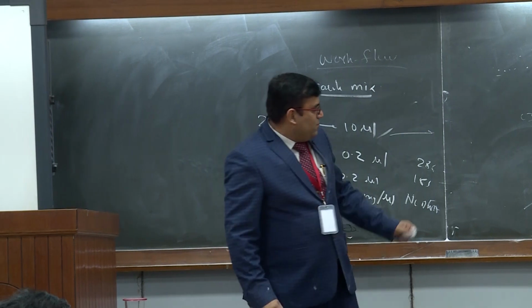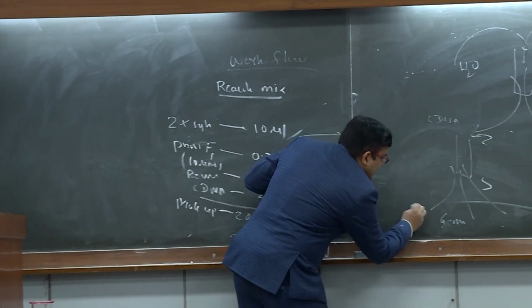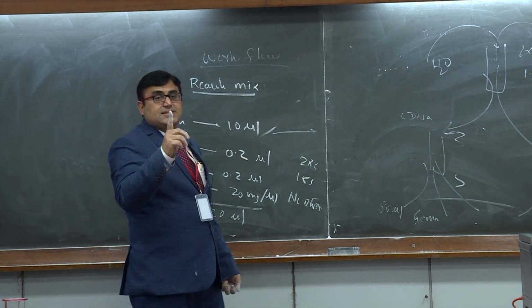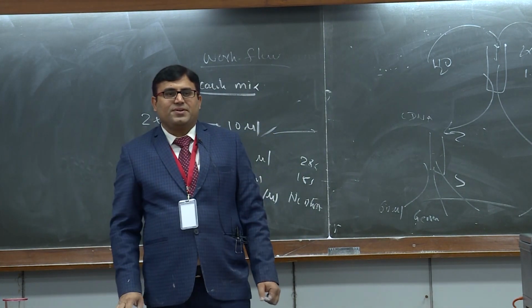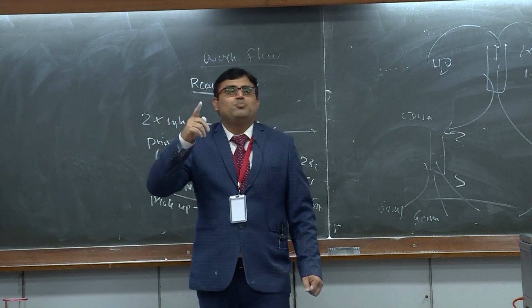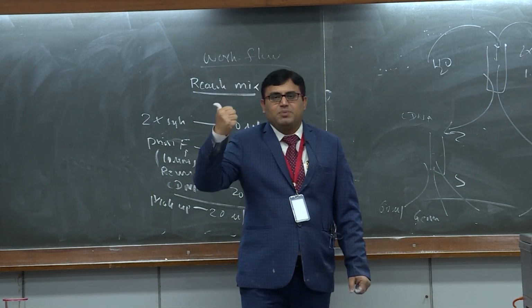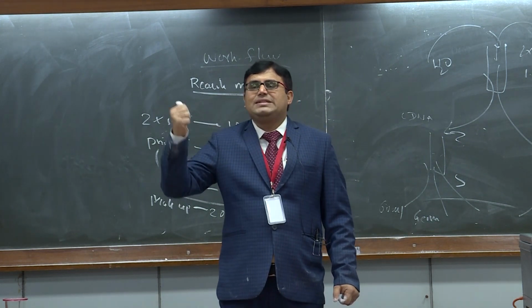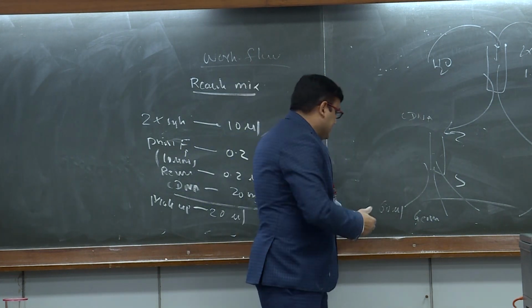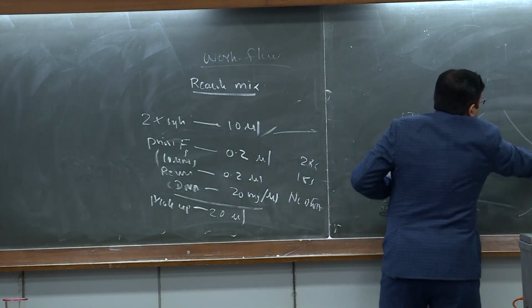Right? Now once you divide this and when you quantify, your volume should be exactly 60 microliter. Why 60 microliter? 20 into 3, and 20 is your volume per reaction. So 3 replicates. If it is exactly 60, it means your pipetting is perfect. Now you are ready with loading the sample onto the semi-skirted plate. So once you have done pipetting like this, the Eppendorf is ready with you, volume is 60 microliter, then take the skirted plate.